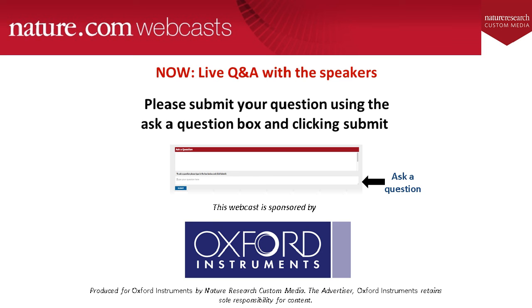Excellent. Thanks, Louise. Our next question asks, what should be the ideal probe current range of a microscope to get good biological EDS data? I think it depends on your sample, how abundant the element is that you're trying to find, but also how you've prepared your sample affects how beam reactive it is.